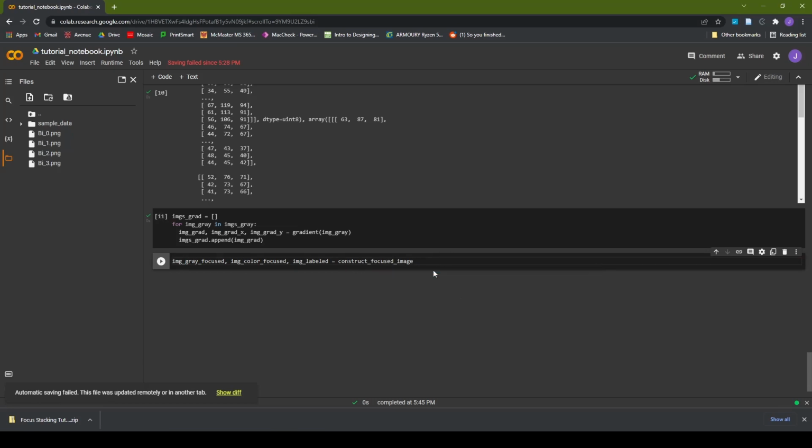If you press Tab as you type along, Google Colab will finish the function definition for you.